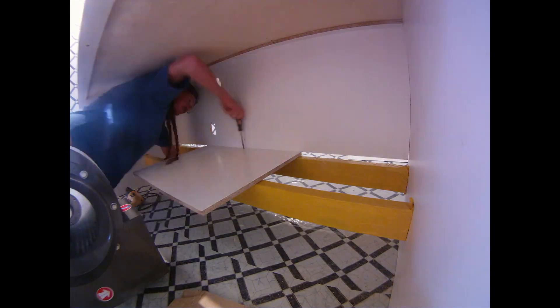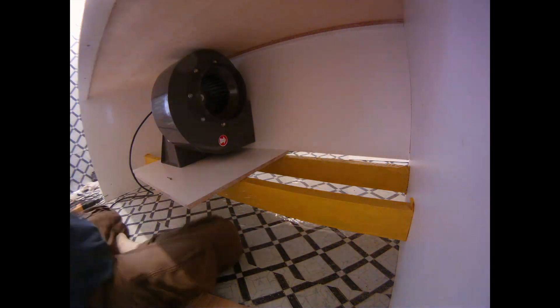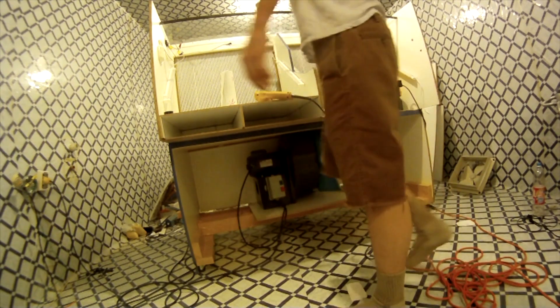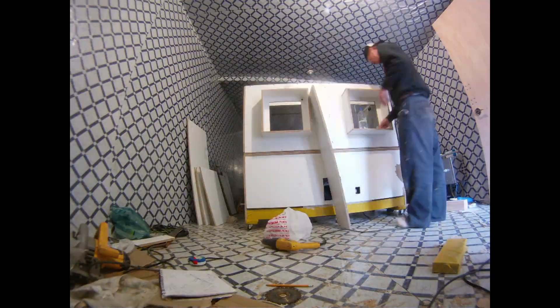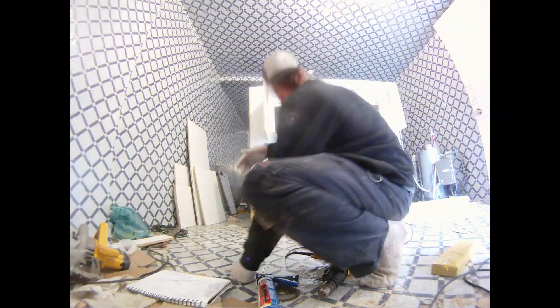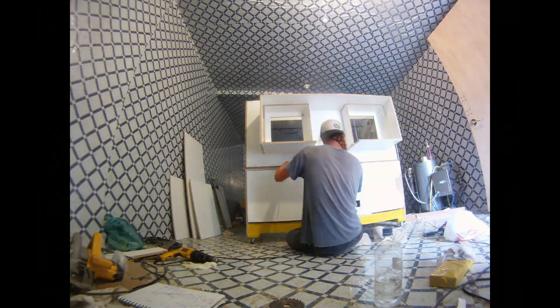I took out the exhaust fans and below there I put a squirrel cage blower fan pushing through. Originally that fan had no filters — just a loose pre-filter — but it was very loud. It was an Ecuadorian-bought fan, and I wanted to change that setup, so I got a Dayton blower.